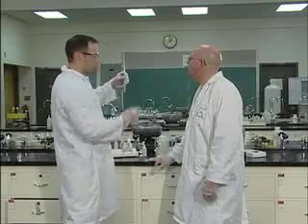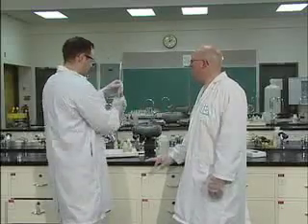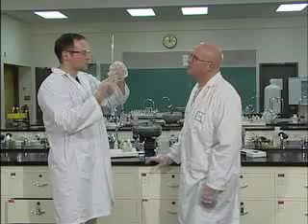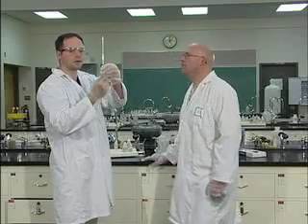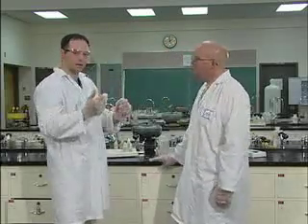Now the first thing I'm going to do once I've added those drops is put the cap back on my calcium oxide. Okay, and then I'm going to measure the temperature of my solution. And in this case, as you can probably see, it's gone up by 4 degrees. It's about 28 degrees Celsius, I think. Yeah, just about 28 degrees Celsius. So the temperature has gone up. Temperature change. Chemical reaction. Yeah, an indicator of a chemical reaction.